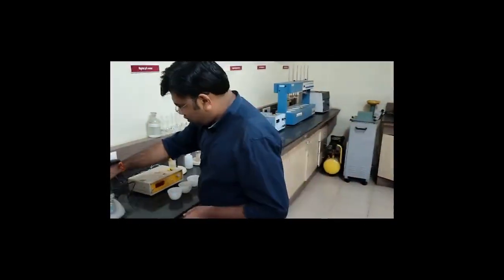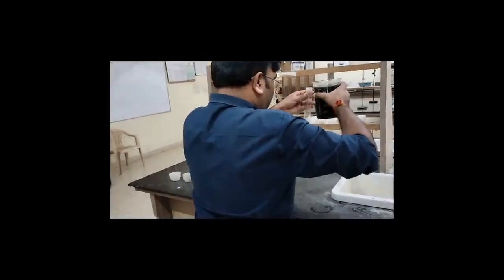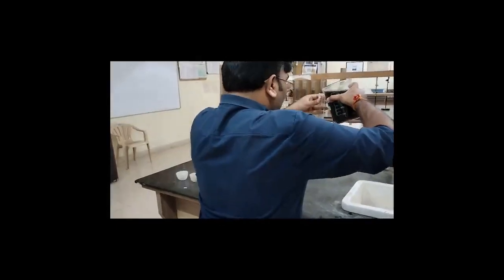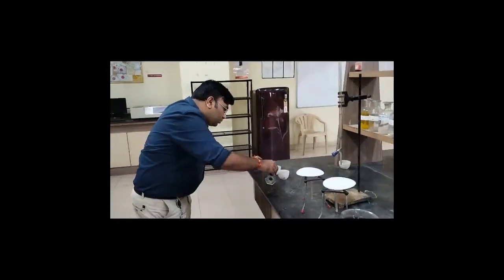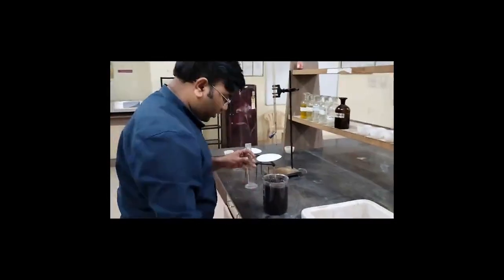Right, so we have taken the empty weights of these crucibles. Crucible 1 and 2 will be taken first, right, and we are going to put 25 ml of sample in each crucible, right, and the sample again we have to stir properly, then we have to take it. Every time you take the sample, make sure that you are stirring it properly.